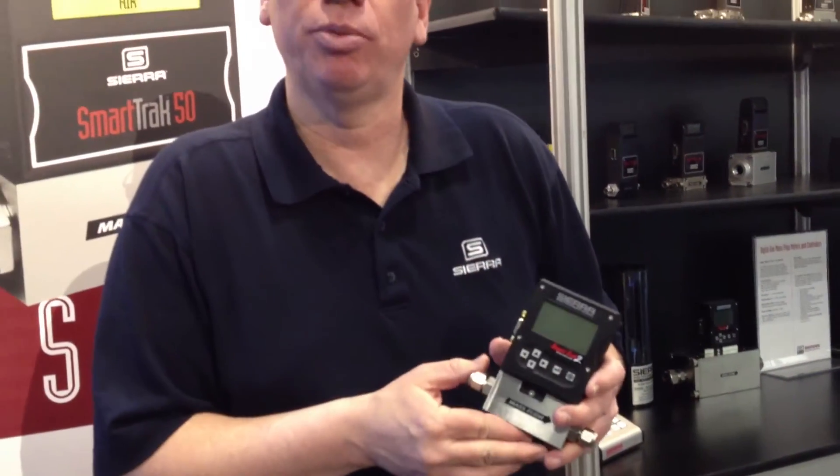The C100 works great on ammonia. It's not one of the pre-programmed gases, but an easy gas substitution will put ammonia into the C100 and it'll work fine.